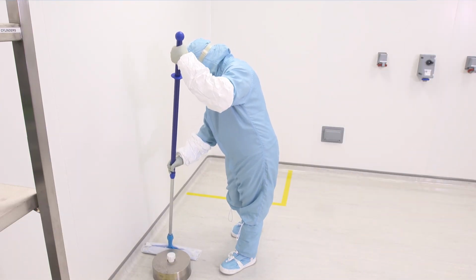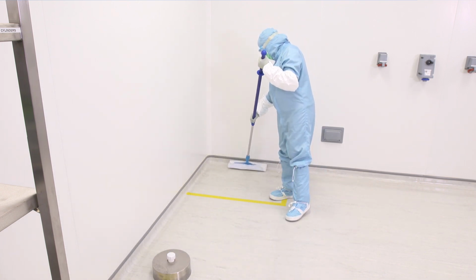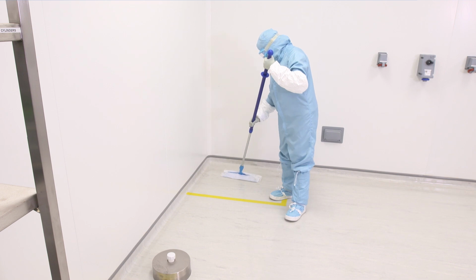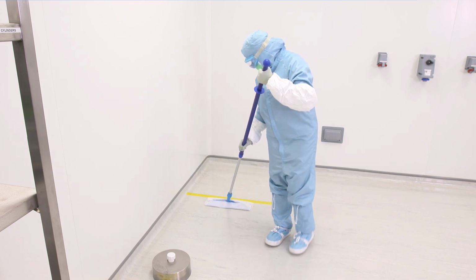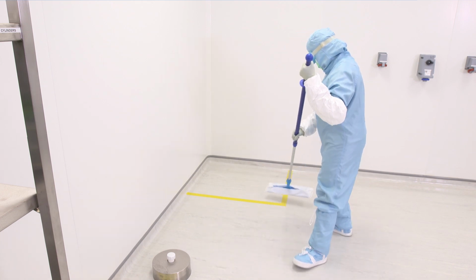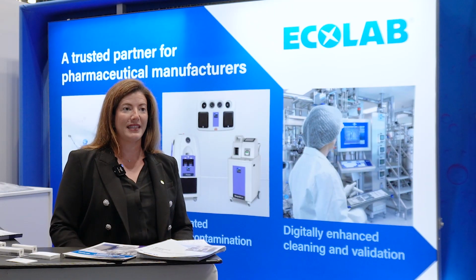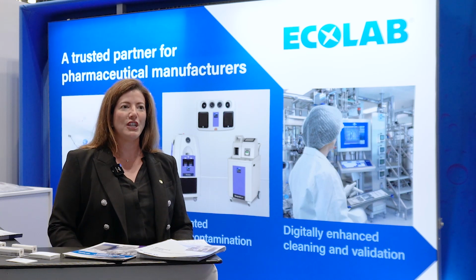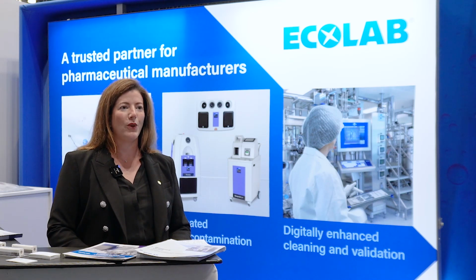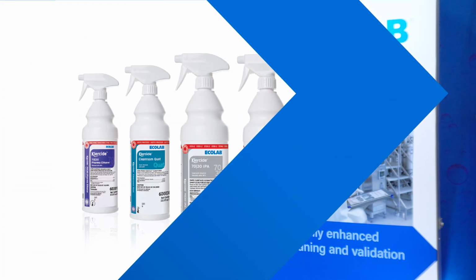And how can residue management be addressed? One of the ways that it can be addressed is by having an appropriate cleaning program. The purpose of cleaning is to help remove any materials off of the surface, including residues, so that the disinfection can be effective. The selection and use of the products, the application of those products, is really important to ensure that there is not residue buildup over time that then becomes more difficult to remove.